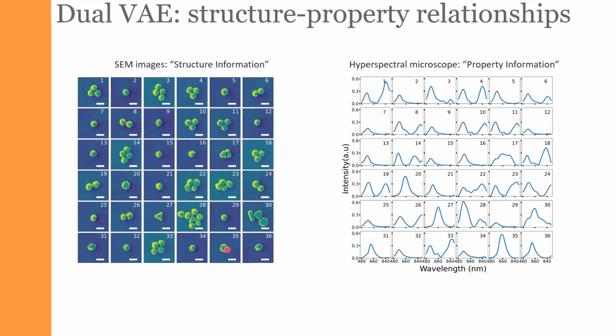And in this case, as you can imagine, that's a fairly painstaking experiment, but it is possible to find all these particles in the hyperspectral optical camera, meaning you can just take the optical spectra, and then you have hyperspectral images like this one. You can see that the complexity of the spectrum depends on how many particles are there in the cluster. If you look at the trimers, number 1 and number 4, you can see that there are two peaks in the hyperspectral optical image.